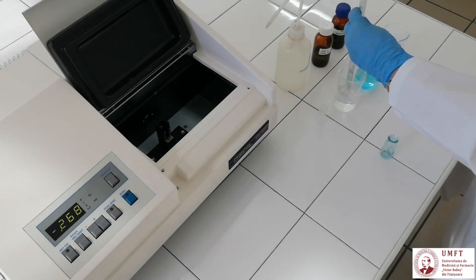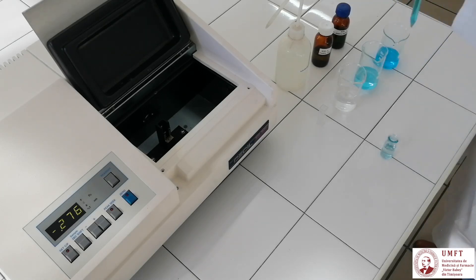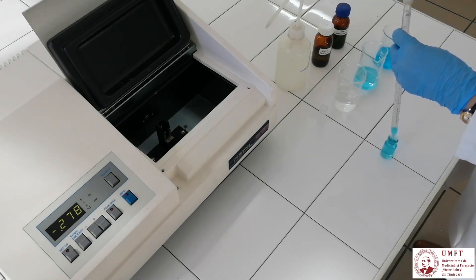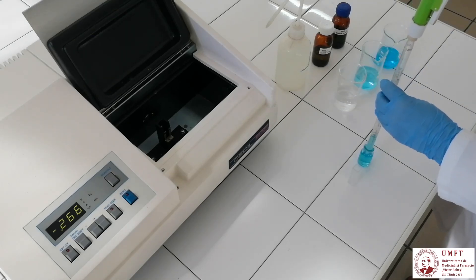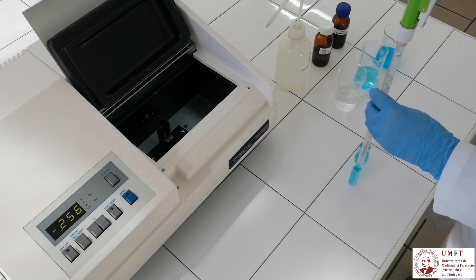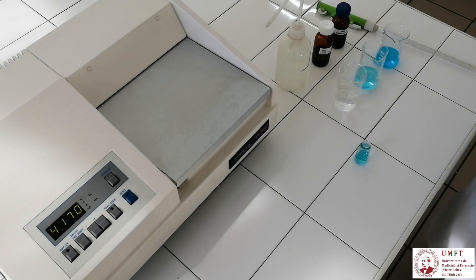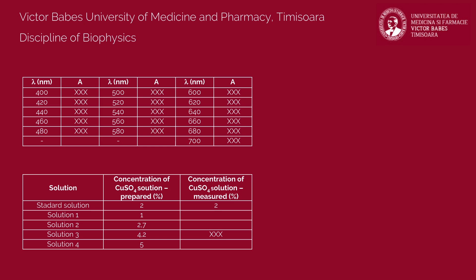Using a graded pipette, measure the volumes of the two solutions and mix them in a bottle. Using the same pipette, transfer the prepared dilution into a cuvette, which you will then place into the spectrophotometer. Read the concentration value shown on the display and write it in the second table. Repeat the steps to prepare the other three dilutions, determine their concentrations, and fill the remaining values in the table.